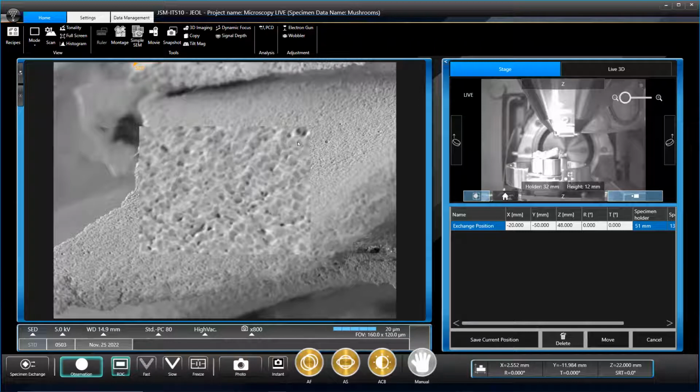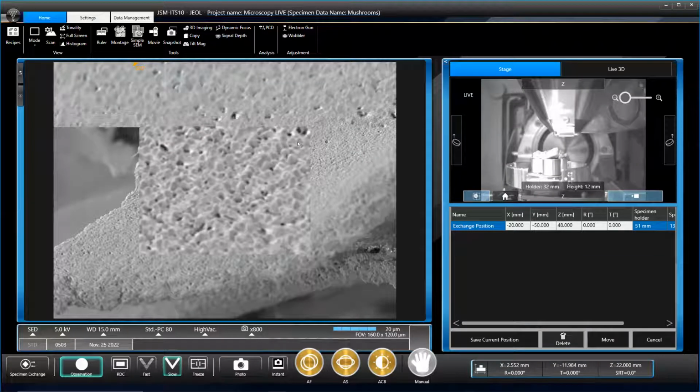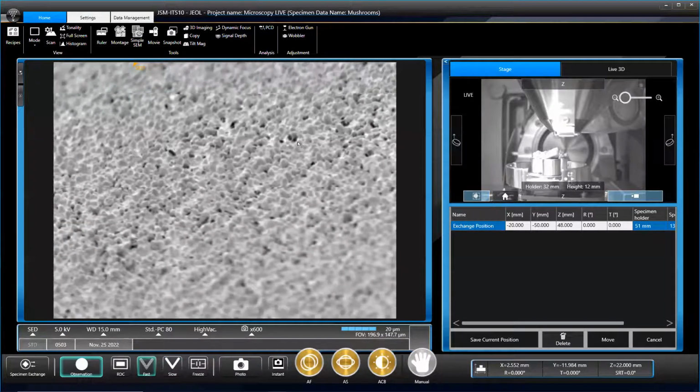I've checked the scopes and they have little reduced windows, like a little box in the centre. It's basically just a nice easy way to load a smaller image. So rather than waiting for the whole image to load each time with these big and small changes, it's easy to do it on a little square. With electron microscopy, we're trying to focus at a higher magnification on what we want to look at, because then as you pull back, the entire image is in focus. 800 times? Nothing in terms of electron microscopy. For us as geologists, quite a lot. But for electron microscopes, nothing at all.